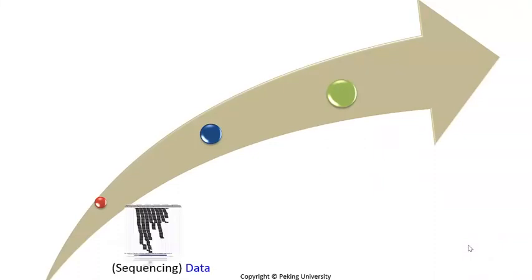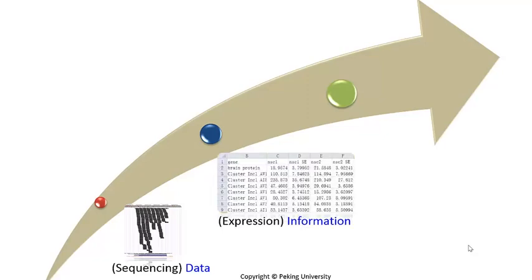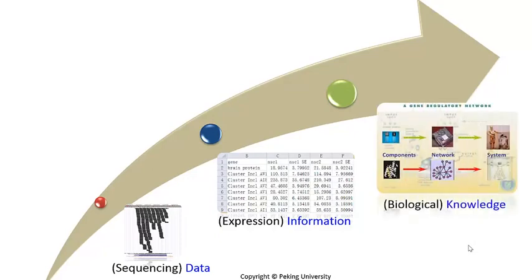As we mentioned before, the transcriptome can be considered as a snapshot of the gene expression profile in cells at a particular moment. Therefore, relevant research usually involves two aspects, qualitative and quantitative analysis. The former is to identify all the expressed transcripts. The latter will determine the expression of each transcript. In the last lesson, we focused on RNA-seq data analysis and briefly introduced how to achieve the above two based on the deep sequencing data.